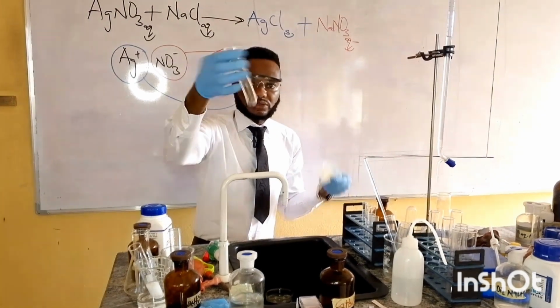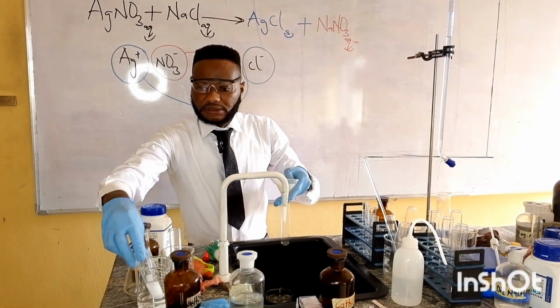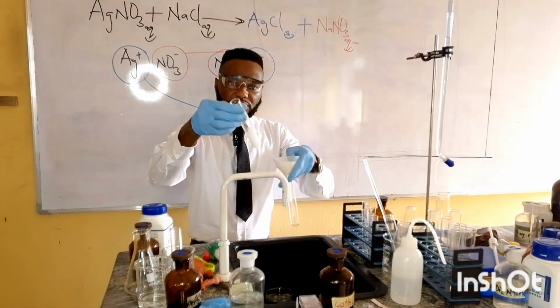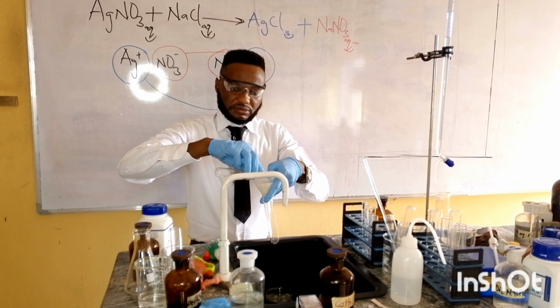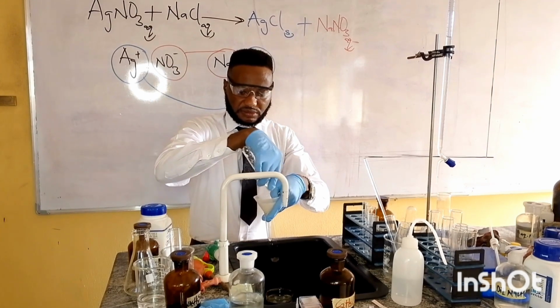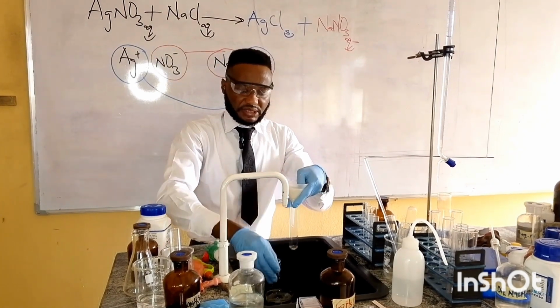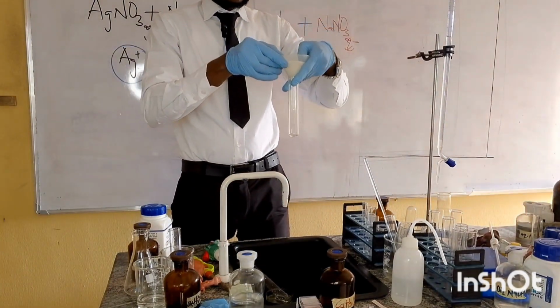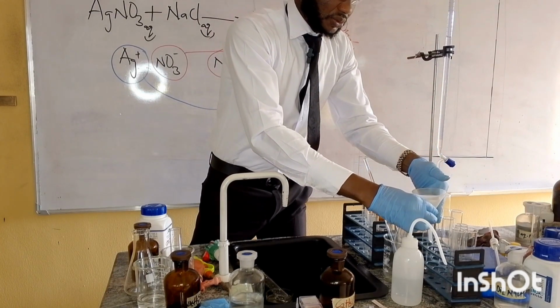This is an empty test tube. Place it here. Then this is it. Shake it very well. You can even see the bottom. See, there are some solids already. So let's keep it here so that the separation can take place.